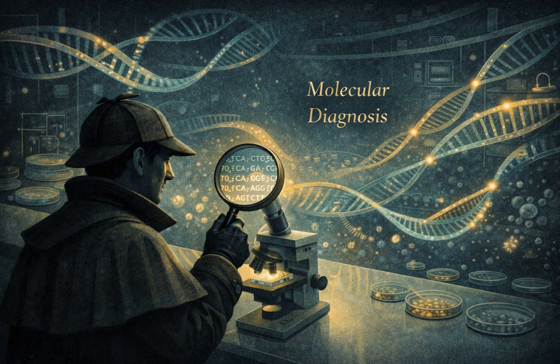And for our last question, question 6. From a laboratory workflow and safety perspective, what is the single greatest advantage of using real-time PCR, or qPCR, over the older traditional gel-based PCR methods? The primary advantage is that it is a closed system. Because the tube is never opened after the reaction starts, it drastically reduces the risk of amplicon carryover contamination, which can lead to false positive results.